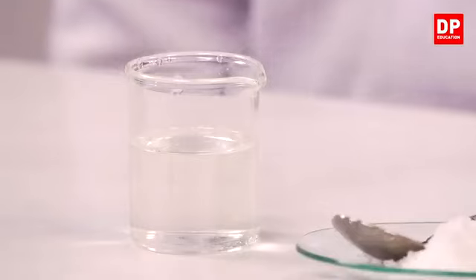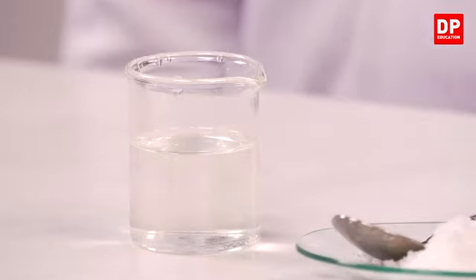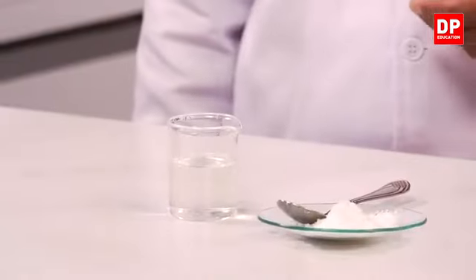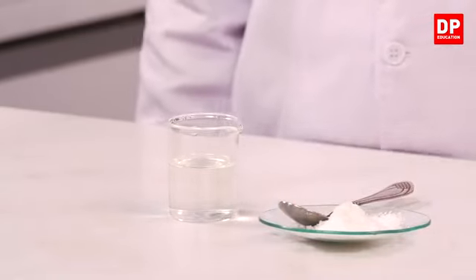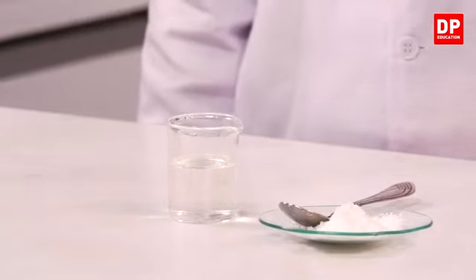So, here you can see students, a clear transparent solution is obtained when sodium chloride is dissolved in water. So, if the transparency, composition and color are all uniform throughout the mixture, we call it a homogeneous solution or homogeneous mixture. In other words, we can just call it a solution.